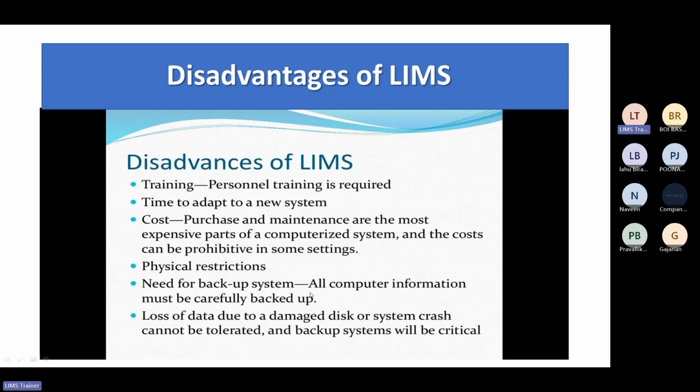See, this is very important. That's why data backup should be taken care of. There should be no damage, and the leak of the data is also required to be prohibited.